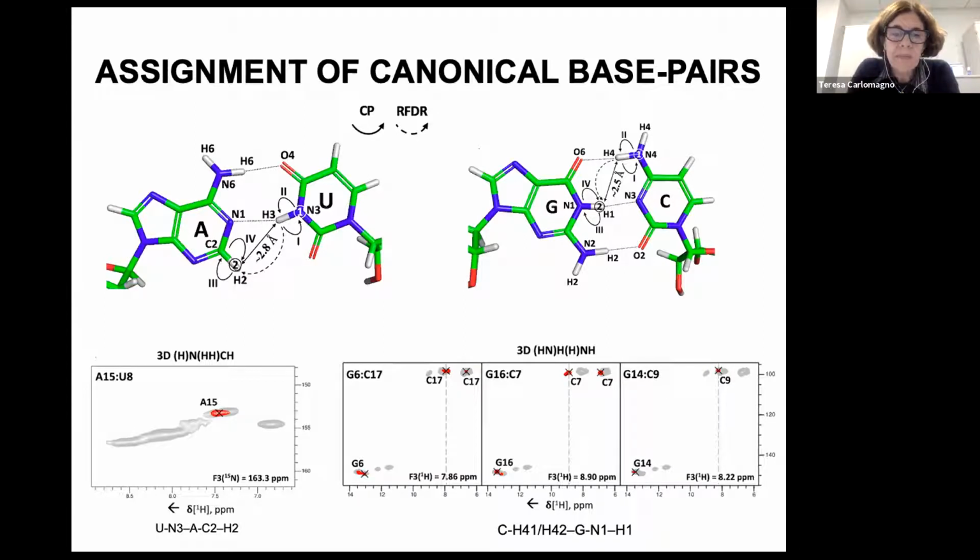Yeah. So what Chris did is, of course, to measure the T1 times and to use paramagnetic metals to elicit an effect on the T1 times. For RNA, we chose not to use metals because these also bind to the RNA. One could have had an EDTA tag that captures most of the metal, but you are never sure that they would not bind to the RNA. So we decided not to use divalent cations, like manganese, for our PRE measurements. So we had the nitroxide tag.